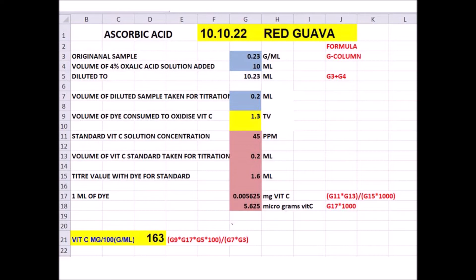In row 17 of the G column, a program calculates the dye factor: (G11 × G13) / (G15 × 1000). This gives 0.005625 mg of vitamin C per ml of dye. So 1 ml of the 2,6-dichlorophenol-indophenol dye is equivalent to 0.005625 mg of vitamin C according to the standard.